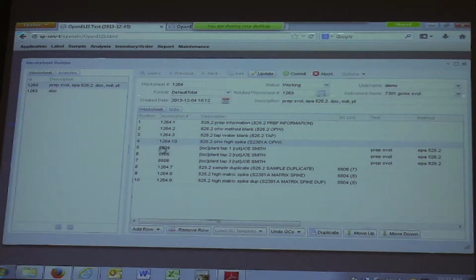But that's where, remember, when you do that, you're changing this position. Wherever you're bumping it, you're bumping something else out of position potentially.